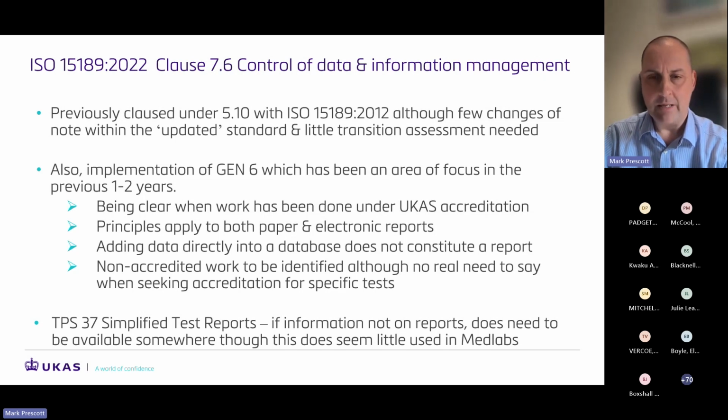It is worth bearing in mind that if there is information that's not on that report, if it's missed off for whatever reason, then you do need to have that information somewhere. But it is a way of simplifying the assessment. I don't think it's used too often in medical labs, actually.